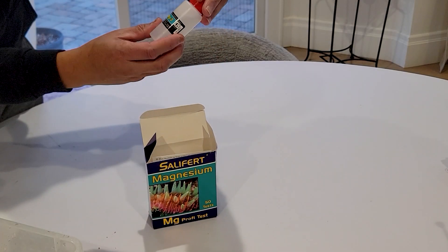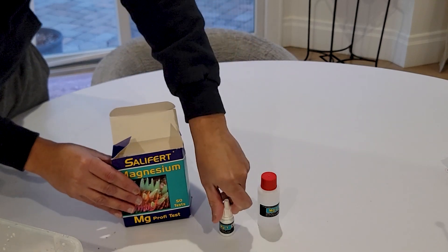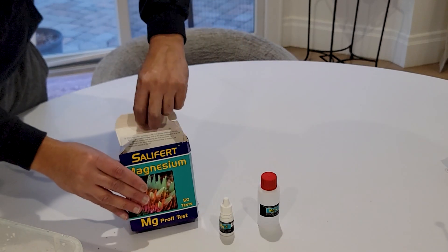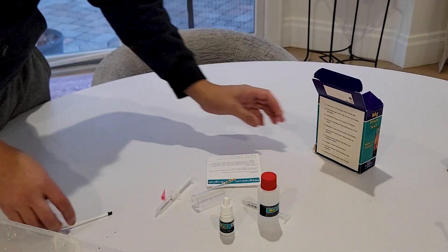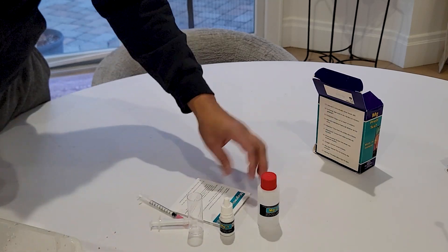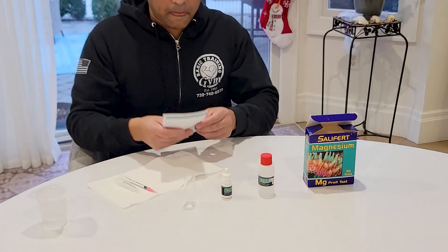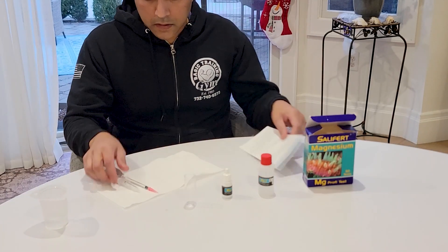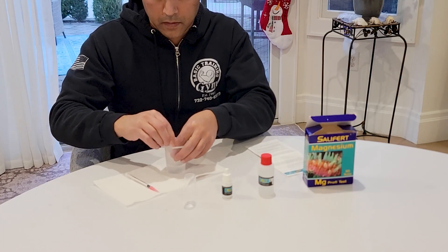I'm using the Salifert magnesium test kit, which comes with two solutions and a pipette. Before this I was using a Red Sea kit and I didn't like it — it took a lot of steps. This one is pretty quick, you can get it done in under a minute, so I really like this kit. I'm going to show you how I test my magnesium and then raise it.